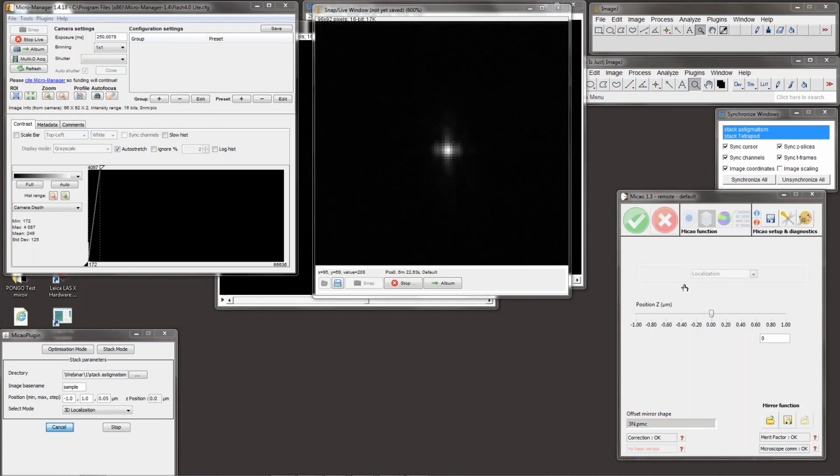But yes, I think it was a very strong message. I mean, the correction at 20 micron, looking at the PSF before and after, it was really obvious that the quality of the PSF has been much improved. And I will just repeat that I will try to share the data. Can you maybe put back the new PSF, not at the surface, but the one corrected at 20 micron, so we can look at it? Yes, sure.